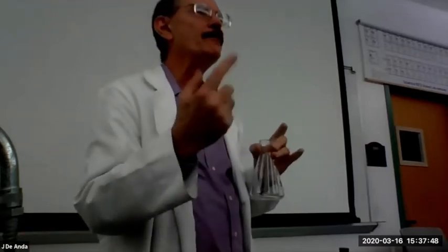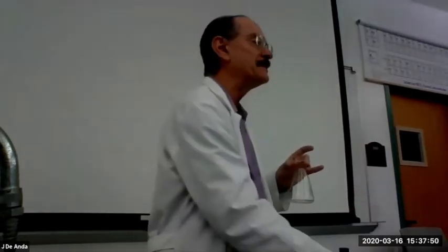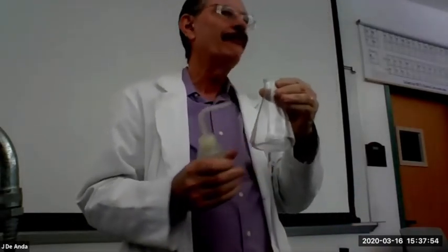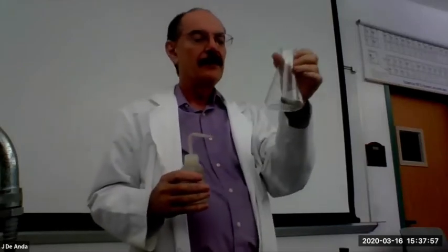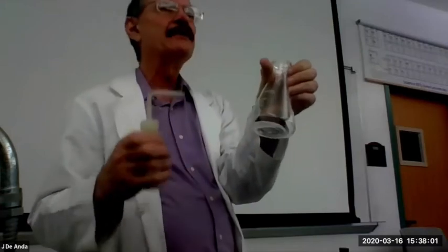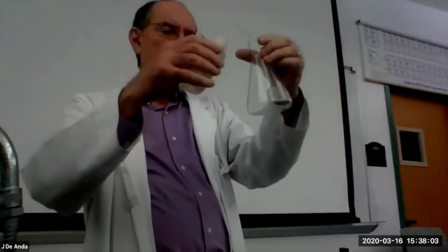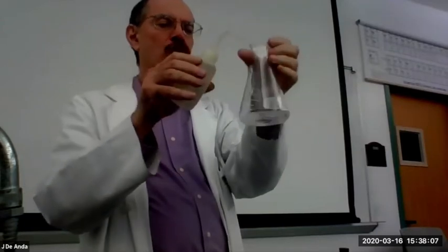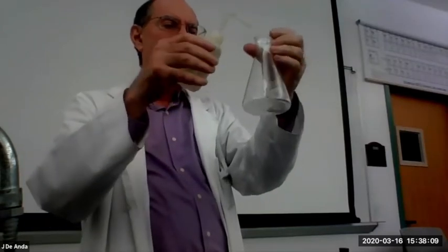All right. Now I want to dissolve it in water. Every time you mix chemicals and it says water, it means distilled water. So I'm going to put in approximately 50 milliliters. If your flask has markings on the side, you should be able to just eyeball it. I'm going to swirl it, kind of shoot it down the sides just to grab everything that's in there.